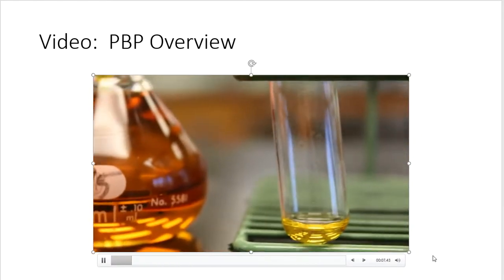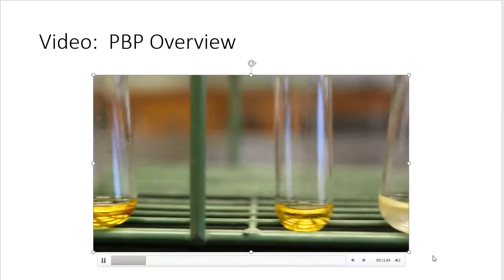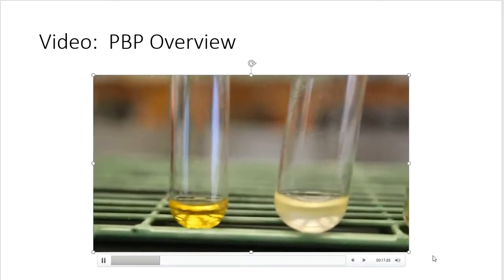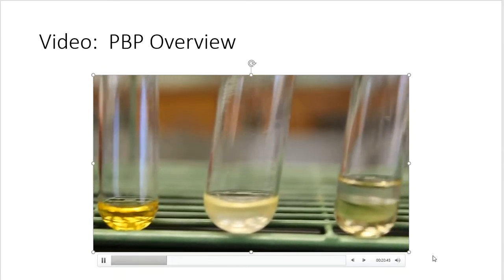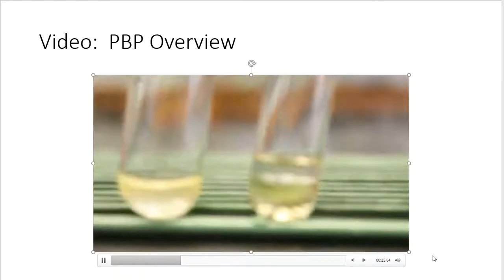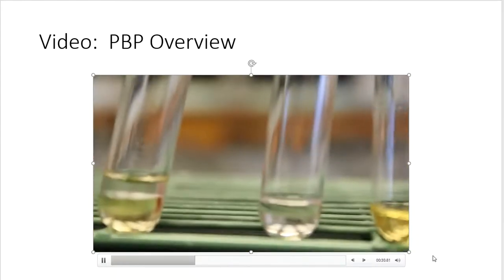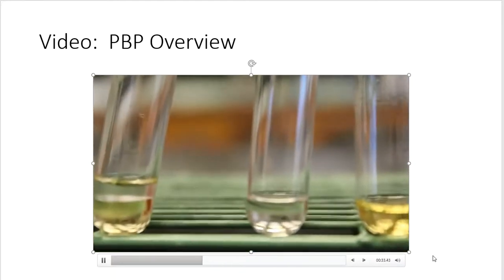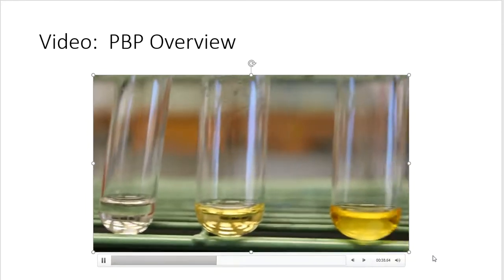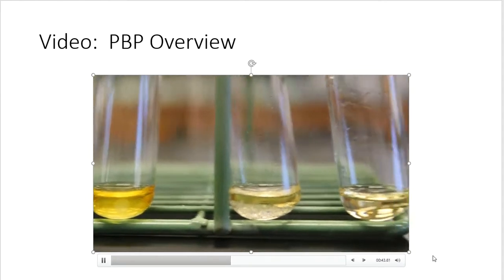And this very first tube is toluene. The second tube is cyclohexane with an ANE. The next one's canola oil. The next one, that looks like octene. The next one is cyclohexene with an ENE. Turpentine, mineral oil, unknown 1, and unknown 2.